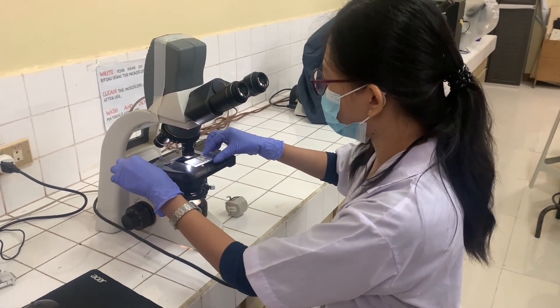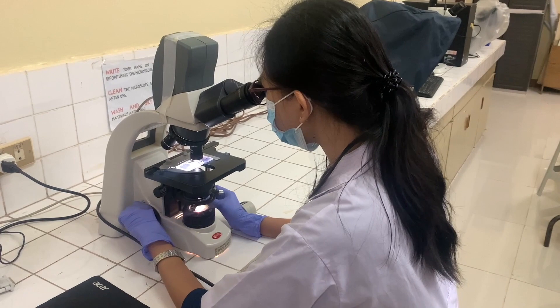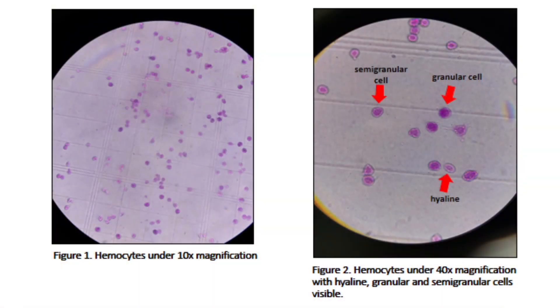Examine the cells under the microscope. You will see small cells under the 10x magnification, but once you shift to the 40x magnification, you can differentiate the different types of hemocytes: the granular, semi-granular, and hyaline cells.